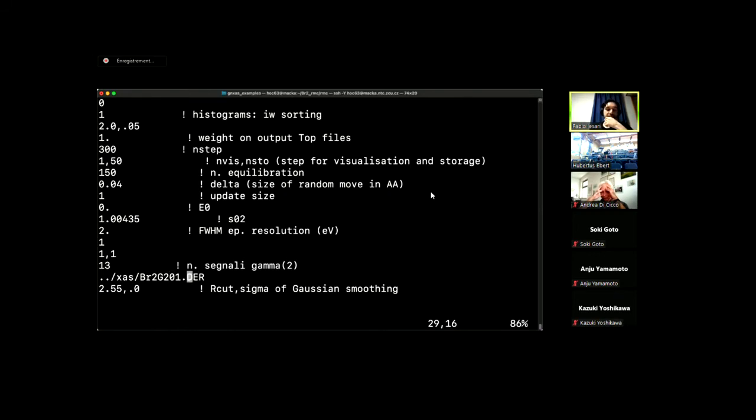And if you remember, this is the total 2 body. So in this case, we are not using the multiple scattering expansions one.